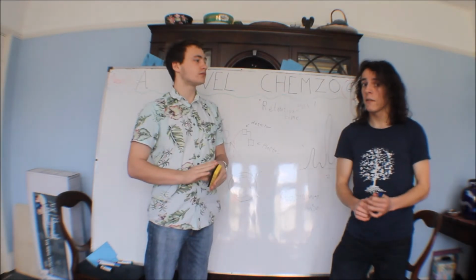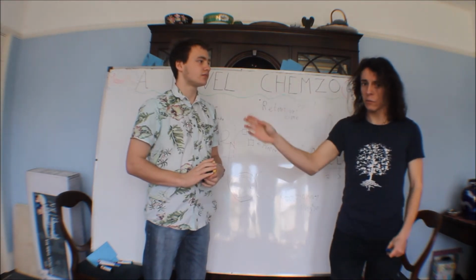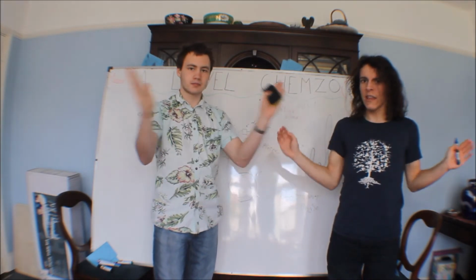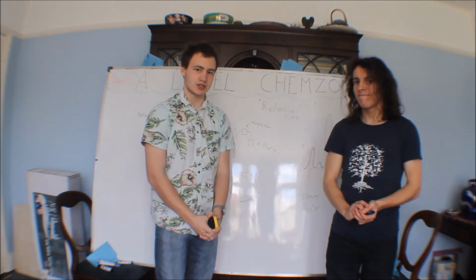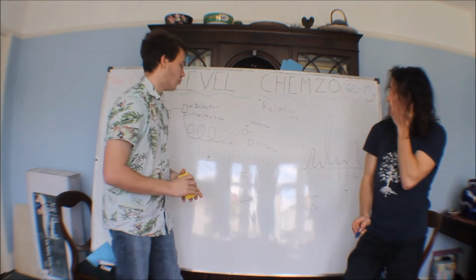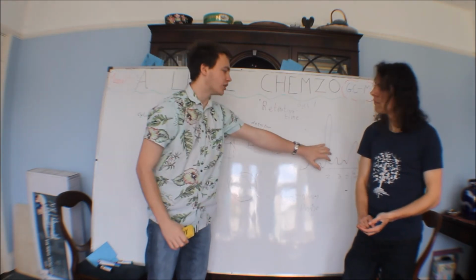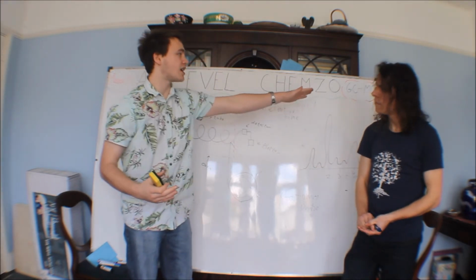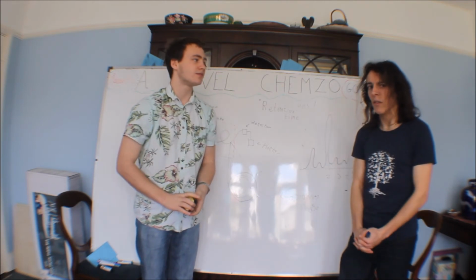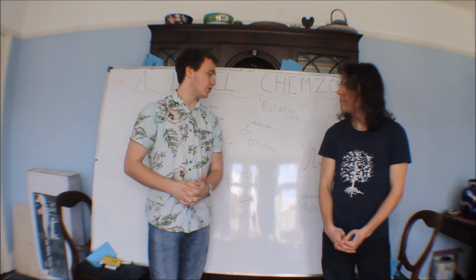And in the exam they often talk about something called GCMS. Now that's just the combining of them: gas chromatography, mass spectroscopy. They were very imaginative. And you might be asked why it's useful to put them together. Gas chromatography separates them, but doesn't really distinguish functional groups. Whereas mass spectroscopy doesn't separate, but it does distinguish. So when you put them together, they're like the best of both worlds. And it's used quite a lot of places, as we've said, airports and so on. Very useful indeed.